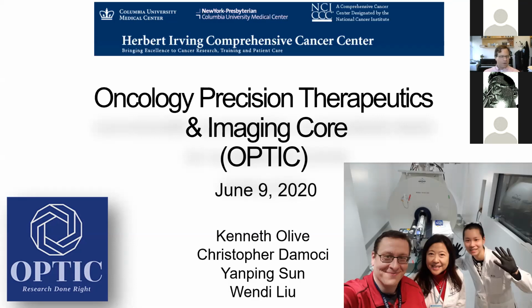And the one thing I want to reinforce more than anything else is that with imaging and the other activities that we do, sometimes not every biologist is aware entirely of what can be accomplished. And so rather than coming to us and saying, I'd really like to image with this technology, could you teach me how to do it? We really encourage our users to come to us and say, these are the questions that I have biologically, scientifically, that I'm trying to answer. How can imaging help me answer those questions? And then we'll have a conversation, we'll get into it.